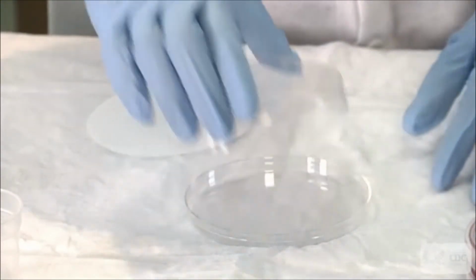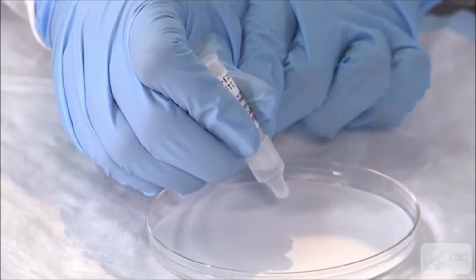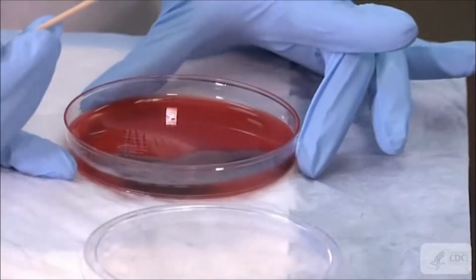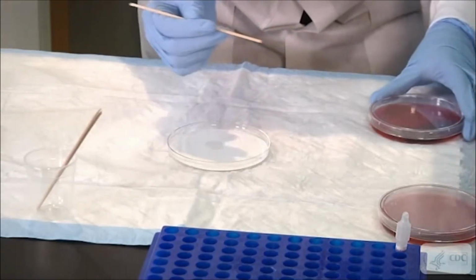First, place a piece of filter paper in a Petri dish. Next, moisten the filter paper with 1 or 2 drops of oxidase reagent. To test the colony, pick an isolated colony with a stick, wire, or loop and smear onto the reagent-dampened filter paper.